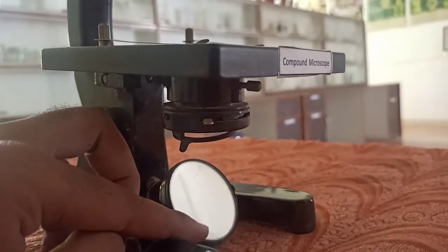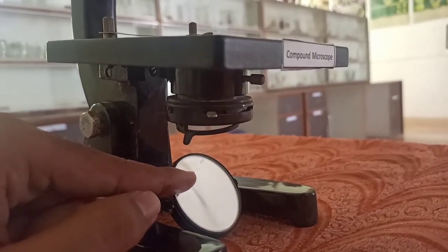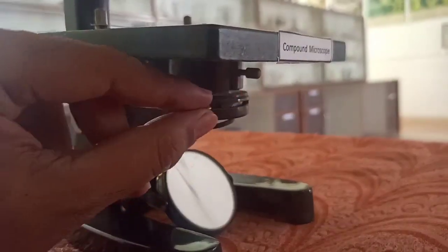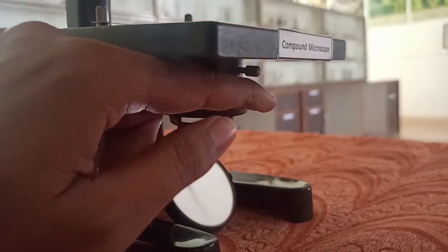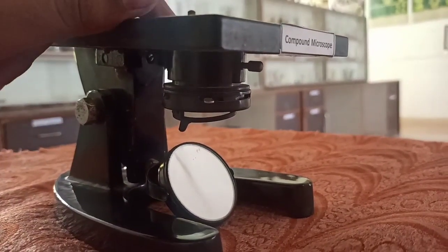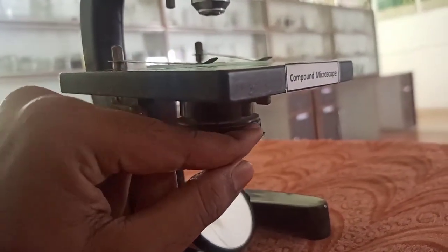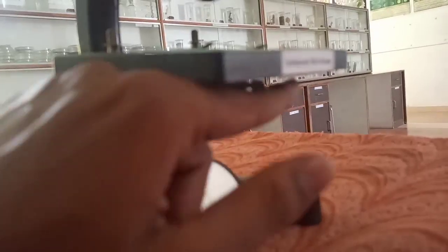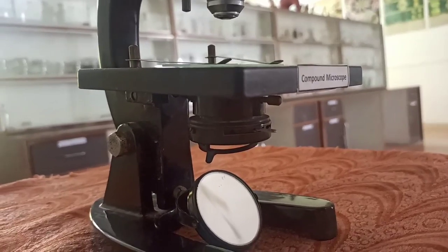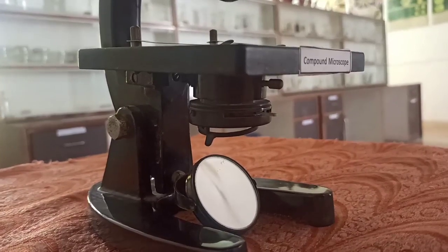Diaphragm is a layer which is meant for restricting the amount of light. For example, if you have a torch inserted, there will be a lot of rays and we don't want too many rays to enter. So we can adjust the diaphragm — we can open or close it — and on that basis, the amount of light going up onto the stage will be decided. So the diaphragm is there, and there is also a condenser. Both the diaphragm and condenser perform somewhat similar functions relating to the intensity of the light.